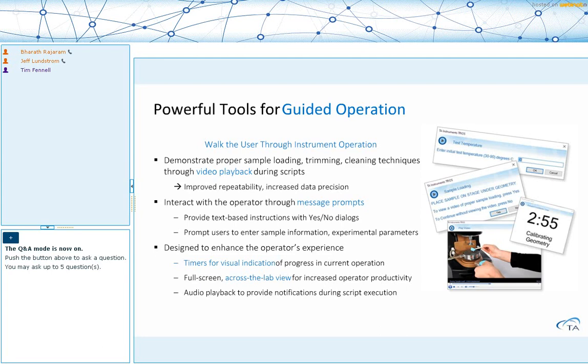The test then starts. This test has about 4 different steps in it. It takes about 20 minutes to run. They're all contained within a single procedure file. There's a frequency sweep to start with. It's followed by a strain sweep that goes outside the linear region, and then you will see a time sweep at the end of it.